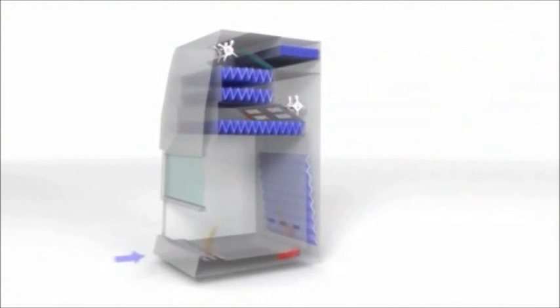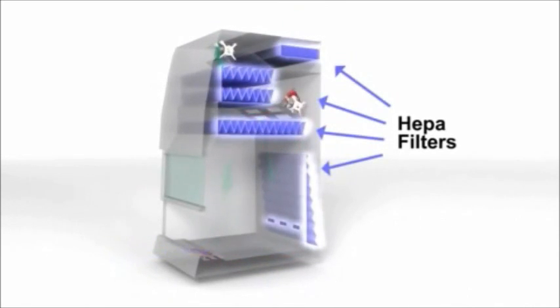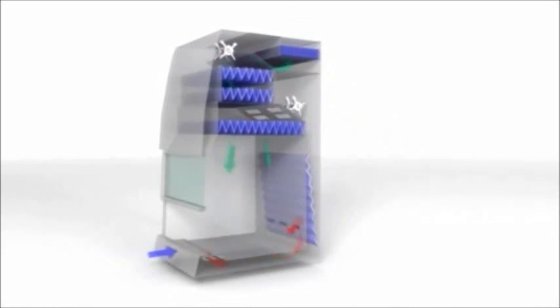Safety cabinets provide user protection by controlling the air flow into and throughout the cabinet. Air is drawn through the front opening where it is passed through a HEPA filter before being returned into the working area as a downflow of clean air, protecting the worker from potential aerosols and the cell line from external contamination.